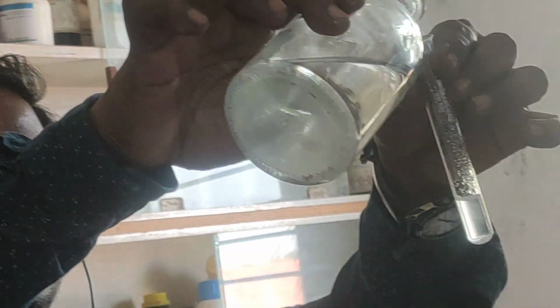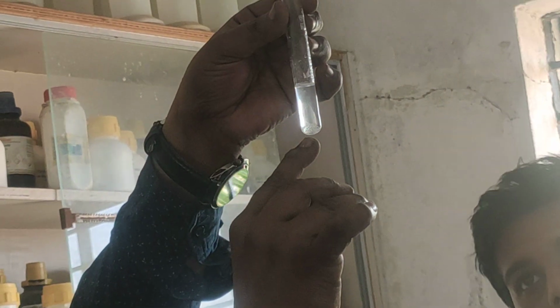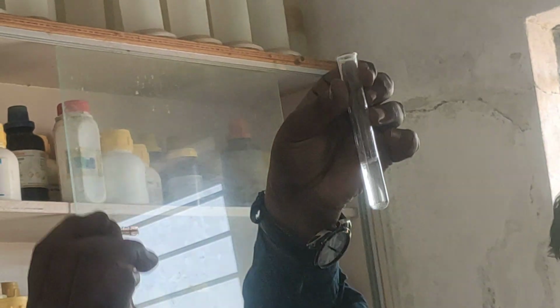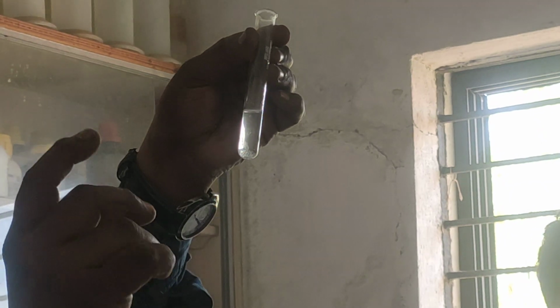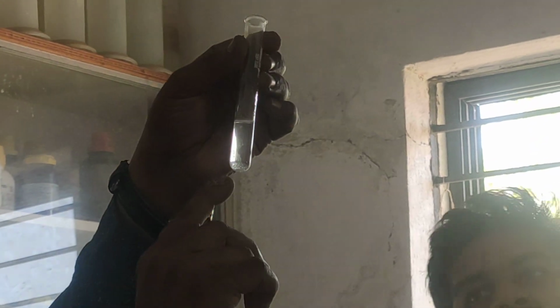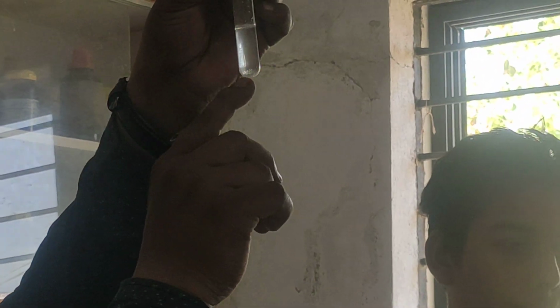Okay? So look here carefully, all of you. Because we are getting the test now, you can observe carefully. See, here some precipitate has settled down at the bottom. You will get very little. For the remaining tests you generally get more precipitate, but here very little. If you take more salt, more precipitate will be formed. We have prepared the original solution very lightly, so the precipitate is formed accordingly.